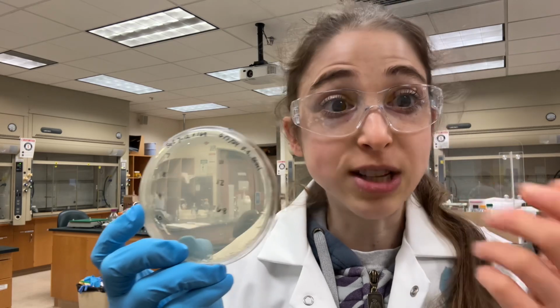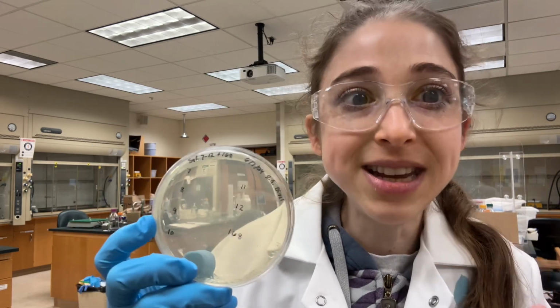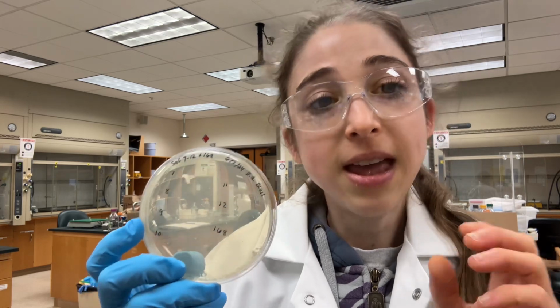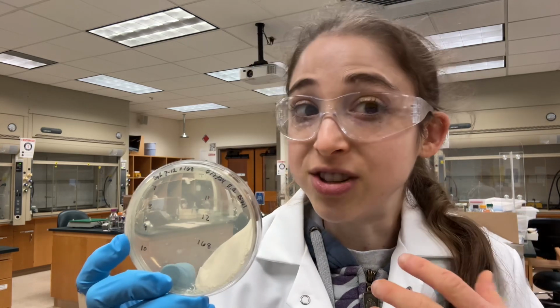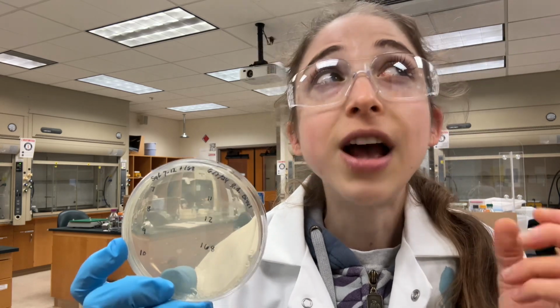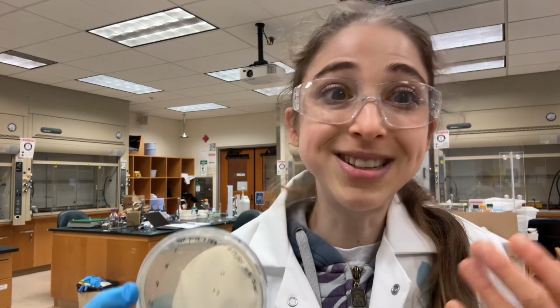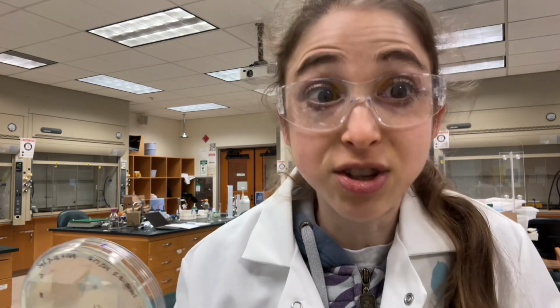We do this genetic swappage, then we grow it in the presence of the antibiotic in order to see whether the swappage occurred. If the swap out occurred, then the bacteria will be able to grow, but if it didn't occur, they won't be able to grow. Assuming, that is, that the bacteria aren't naturally resistant. And so we wanted to test to see, well, are they resistant already?